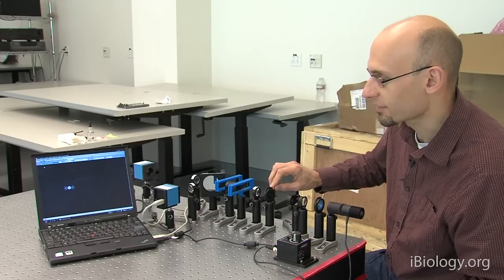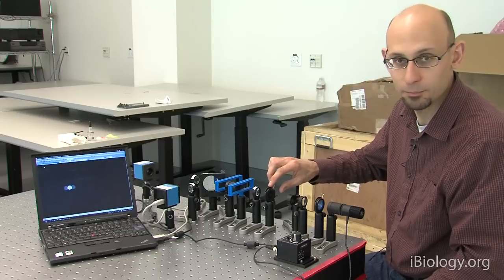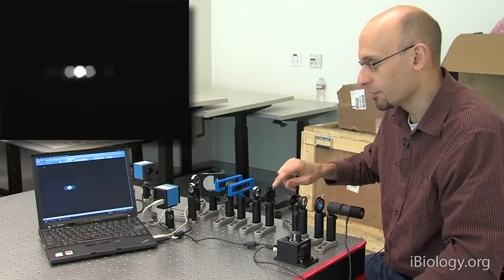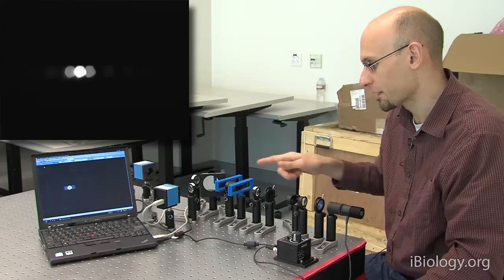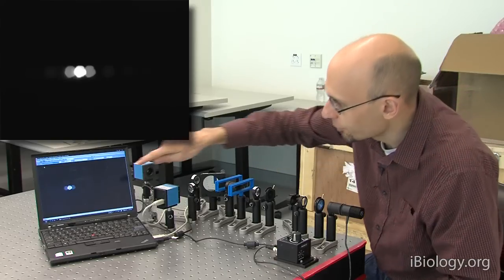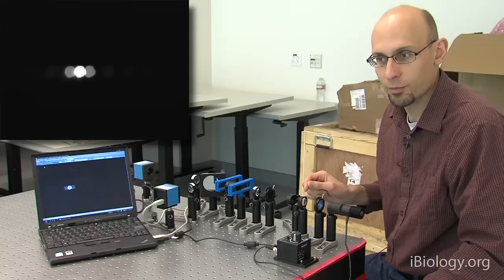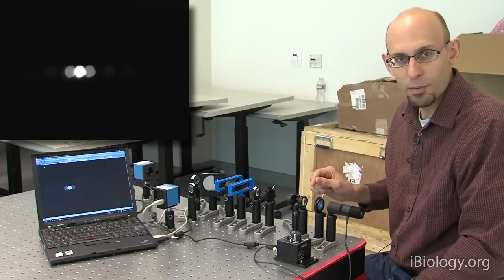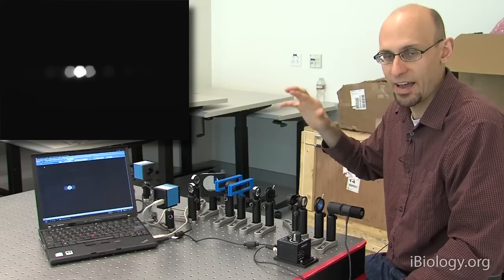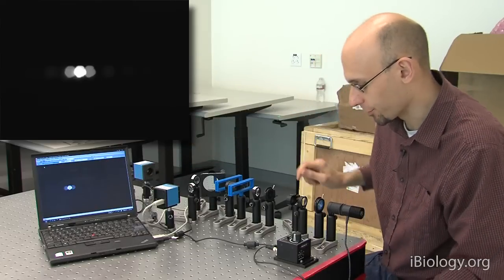So you can first off see that the size of these disks here changes as I open and close the aperture diaphragm. And so the central spot in this image is the image of this aperture diaphragm. This corresponds to light that's making it straight through the microscope without interacting with our sample. The two closely spaced beams on either side of it are light that's been diffracted from this grating. So remember that a striped sample here, so this alternating pattern of dark and light lines, is going to act like a diffraction grating, and it will diffract light, and these are the first two diffraction orders.